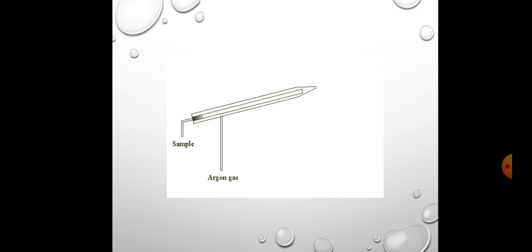This is an animation of a kind of nebulizer that we call the concentric nebulizer. In this nebulizer, as you see, the sample solution will be converted to very tiny, very small droplets, and it will be introduced into the flame with this method.